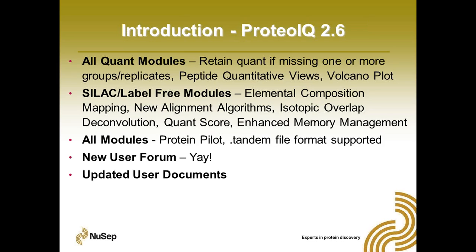So one quick snapshot slide of what's new in the software. We're going to go through each one of these ad nauseum today. First is the new features that are involved with all of the modules, no matter if they're spectral counting or label-free quantitation or anything in between.